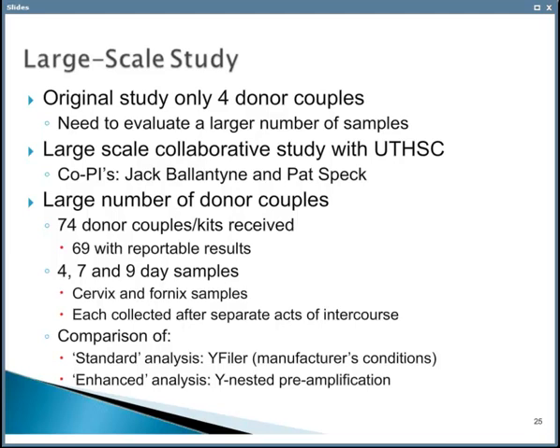69 reported results. What we did was take 4, 7, and 9-day samples after intercourse. We took cervix and fornix samples from around the cervical area, and each were collected after a separate act of intercourse. And we compared standard analysis, Yfiler, with enhanced analysis, which was Y-nested pre-amplification.